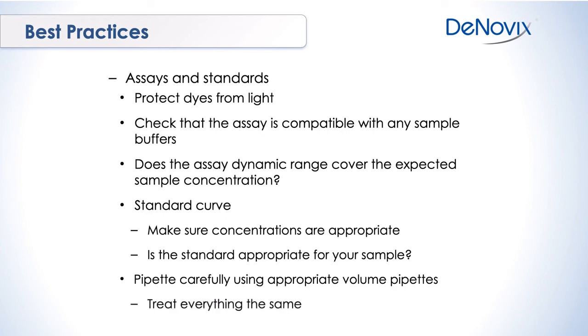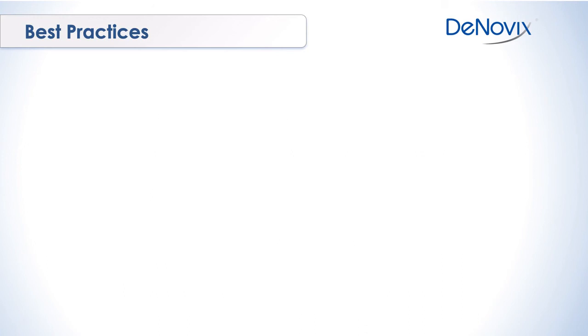And treat everything the same. Treat your samples and your standard as exactly the same. So prepare them at the same time. Use the same reagents when you're preparing them.